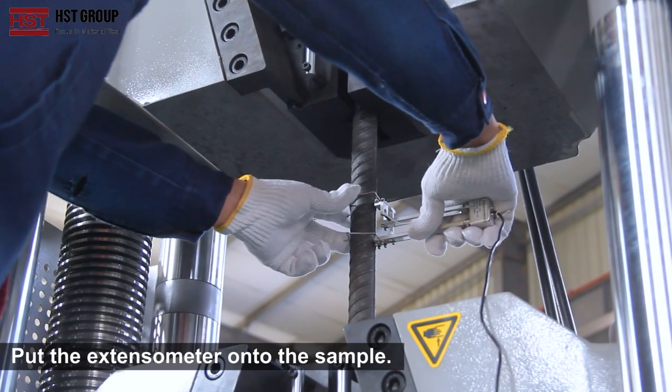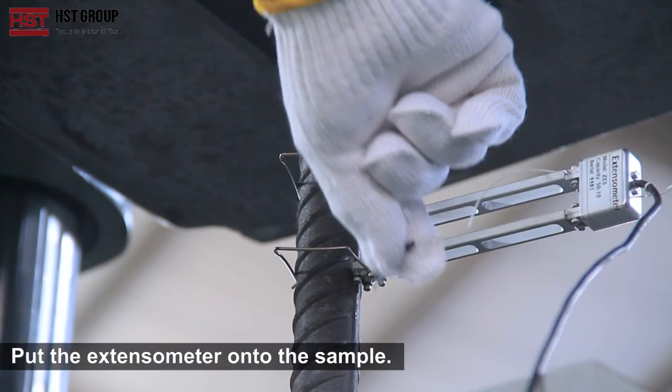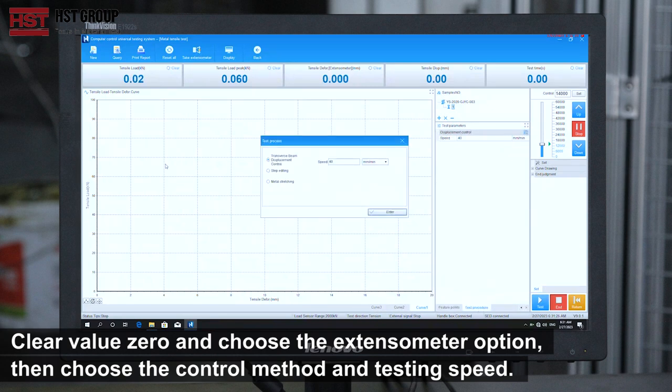Step 5: Put the extensometer on the sample. Clear the load to zero and select the extensometer option, then choose the control method and testing speed.